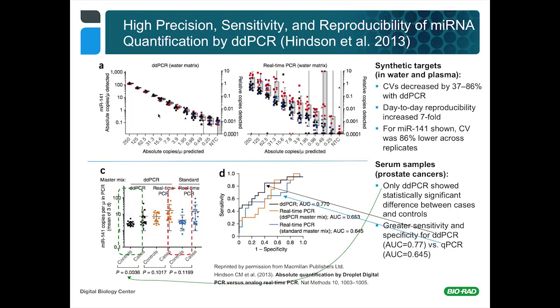And I will emphasize that in each of these 2 curves here with the qPCR on the right, which shows much greater scatter for each dilution point in the series, they were testing for variability in measurement both within the same day, doing 3 different reverse transcriptase reactions, cDNA synthesis reactions on a dilution series of a synthetic target. They were doing that 3 different RT reactions.